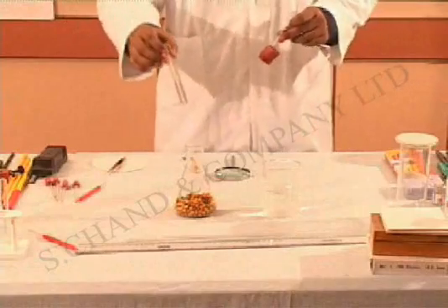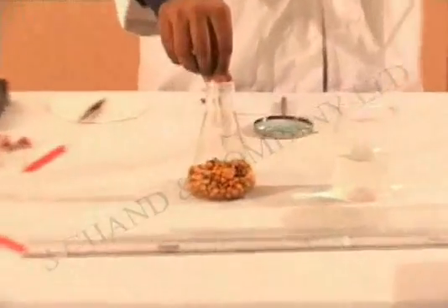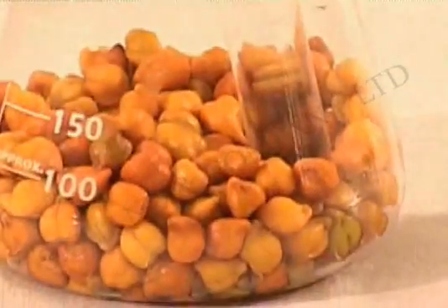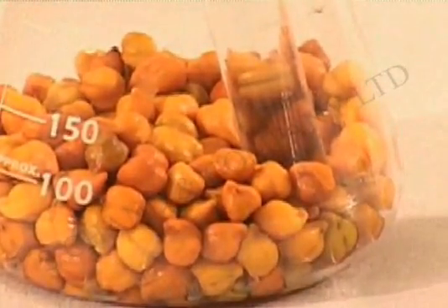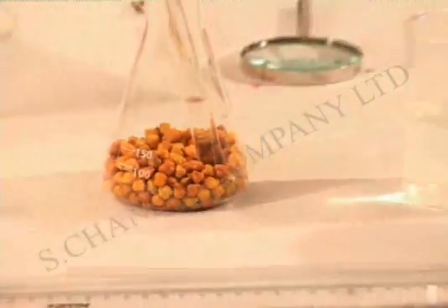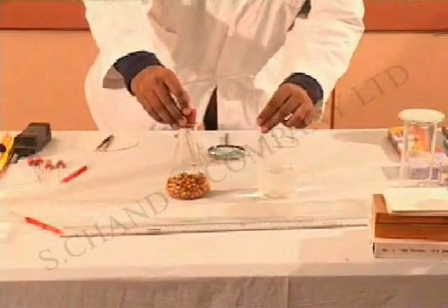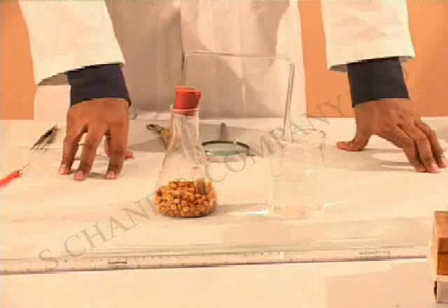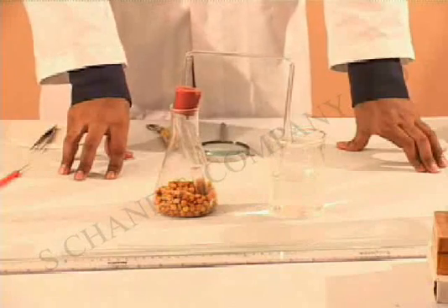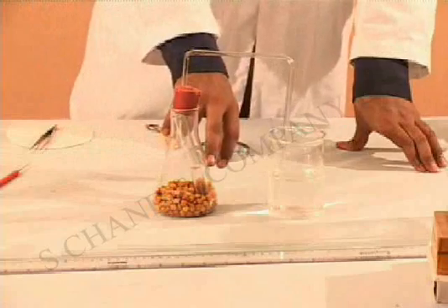I am going to insert this test tube inside this conical flask and then close this with a cork. Now the setup is complete and it is going to take about half an hour for you to see that the lime water turns milky.